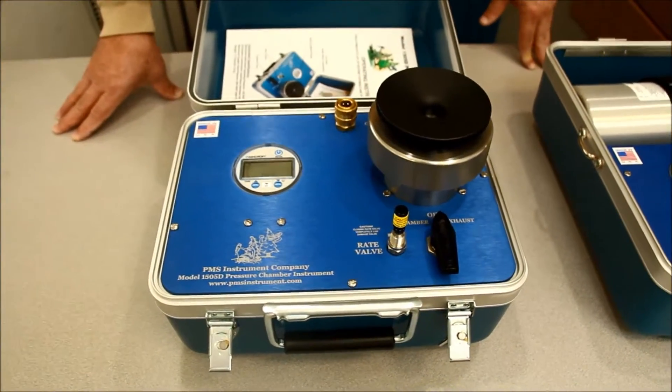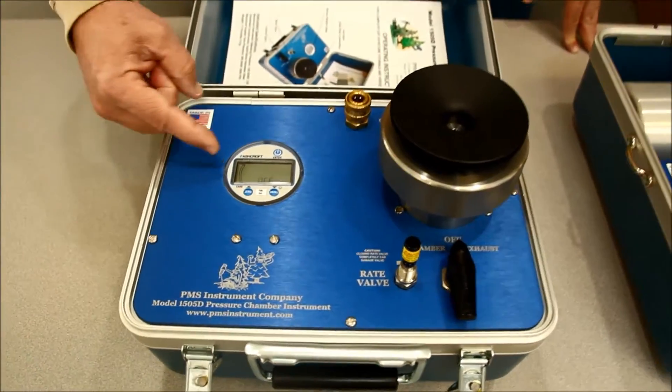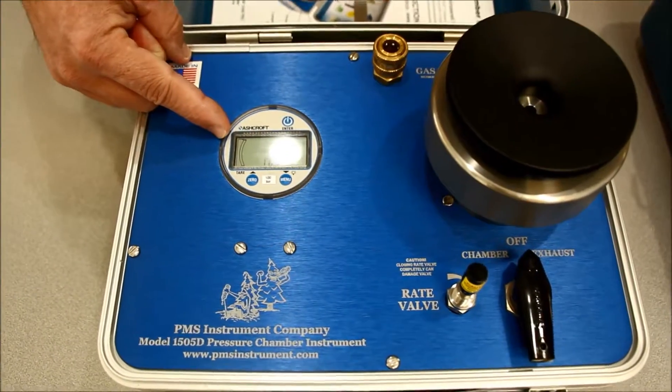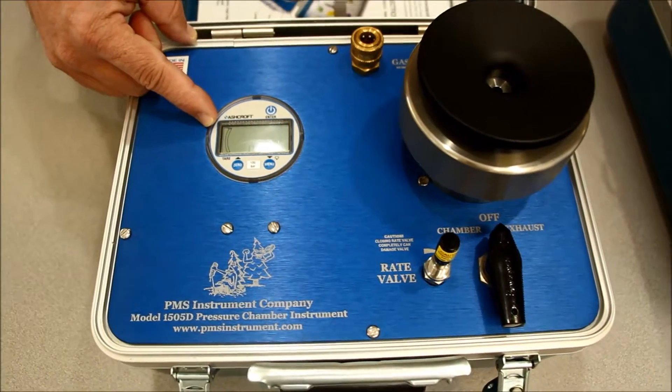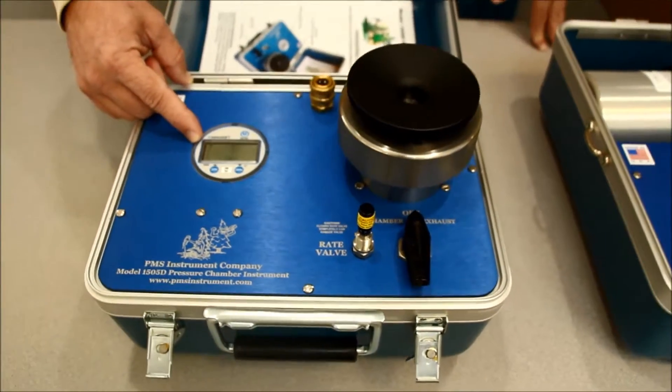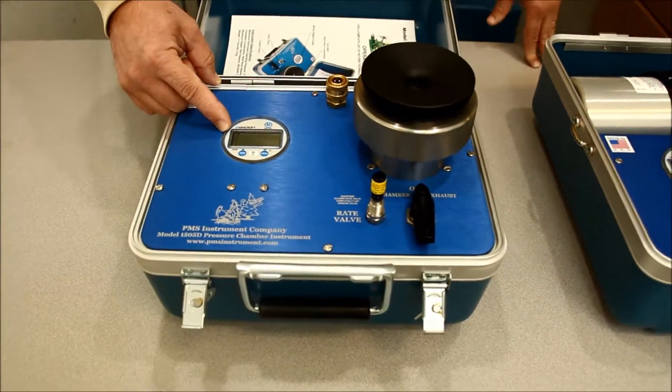Today we're going to demonstrate replacing the batteries for the digital gauge on the model 1505D, 605D, 1515D, or 615D.